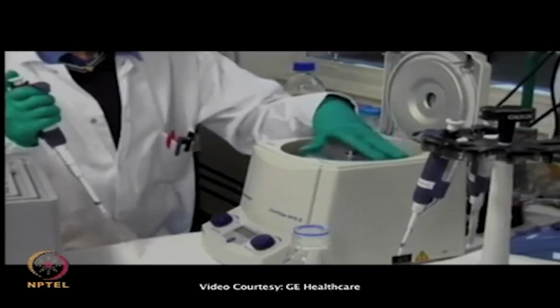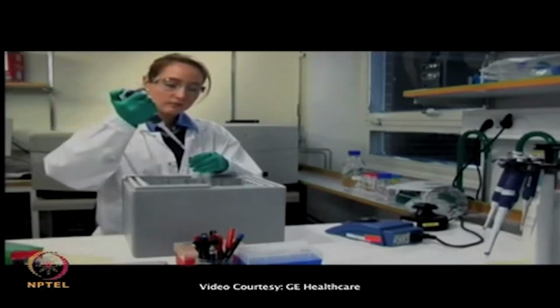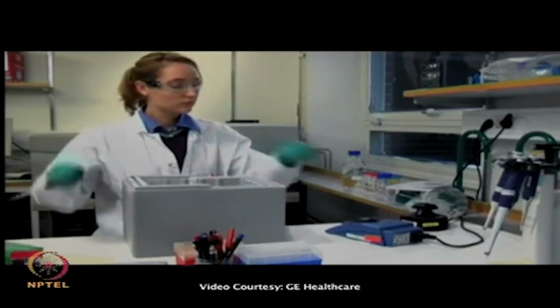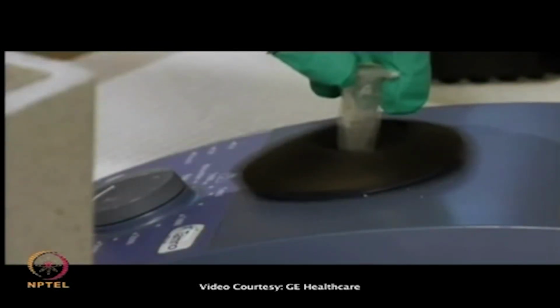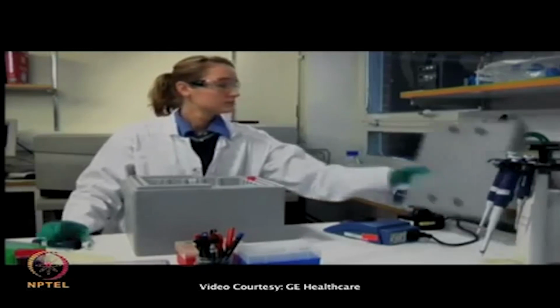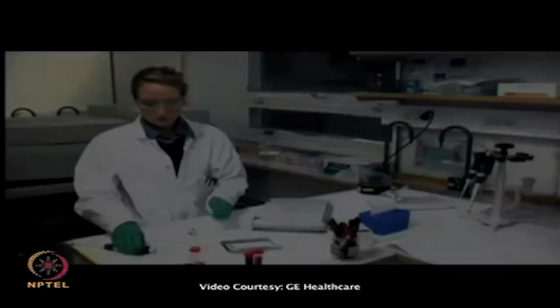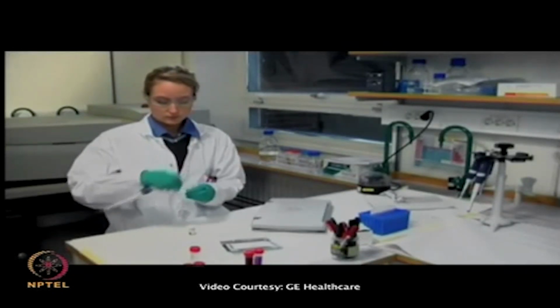The proteins on the cell surface are now labeled and the cells are washed and ready to be lysed. The pellet from the last washing step is resuspended in 150 microliters cold lysis buffer containing 7 molar urea, 2 molar thiourea, 4% CHAPS, 30 millimolar Tris, 5 millimolar magnesium acetate pH 8.5, and left on ice for at least 1 hour with occasional vortexing. The samples are now ready for 2D gel separation.